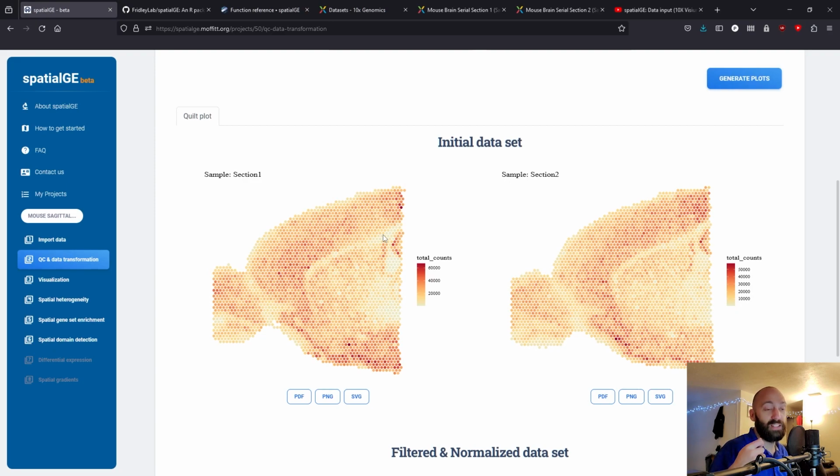So like fibroblasts are going to create extracellular matrix where there's tissue, but there's not going to be any genes that can be identified there. Here, I'm guessing this is probably more structure based. We have high expression here, some high expression down there with more genes being counted.